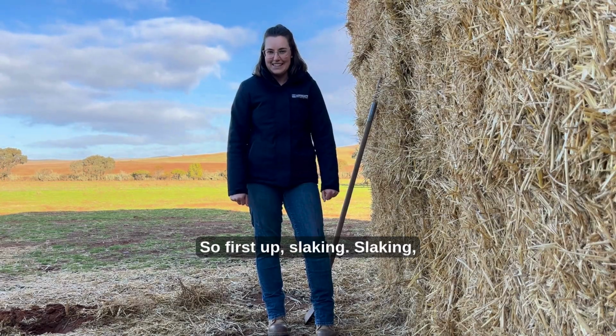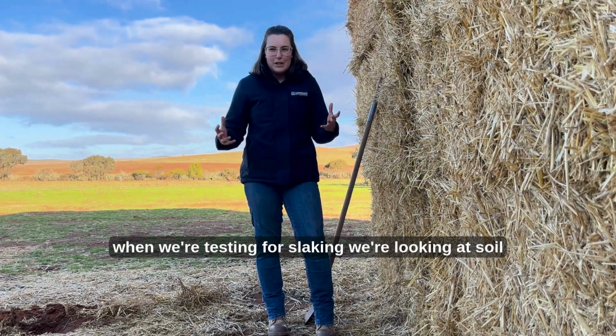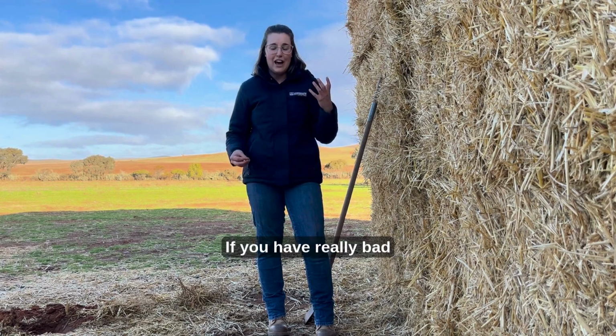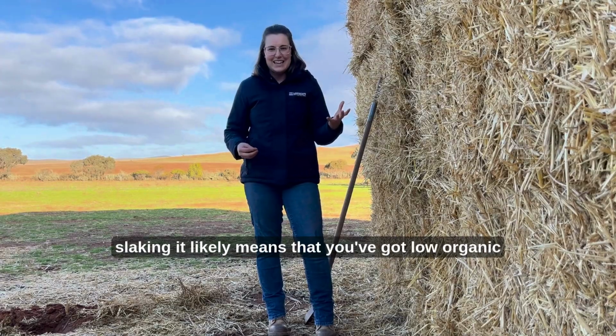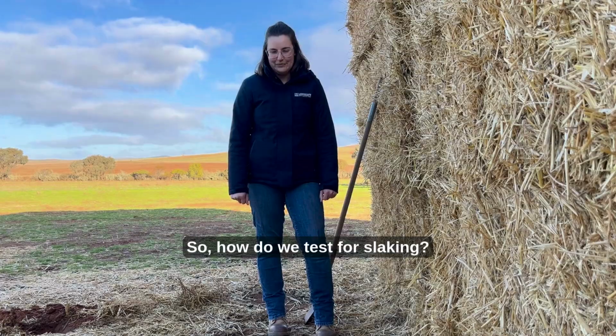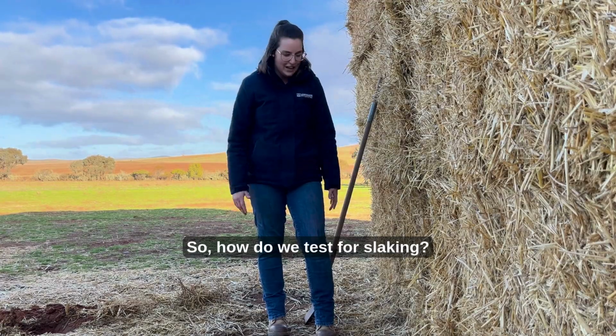So first up, slaking. When we're testing for slaking, we're looking at soil structure. If you have really bad slaking, it likely means that you've got low organic matter in your soil. So how do we test for slaking?